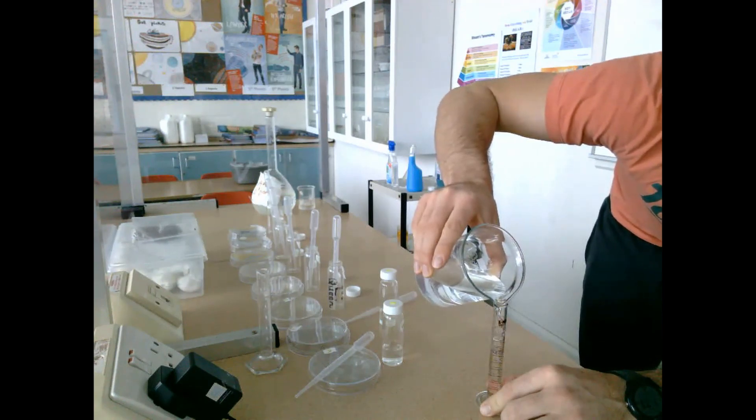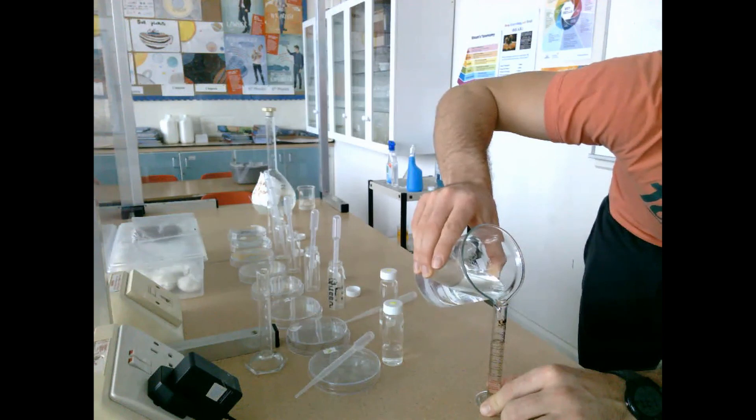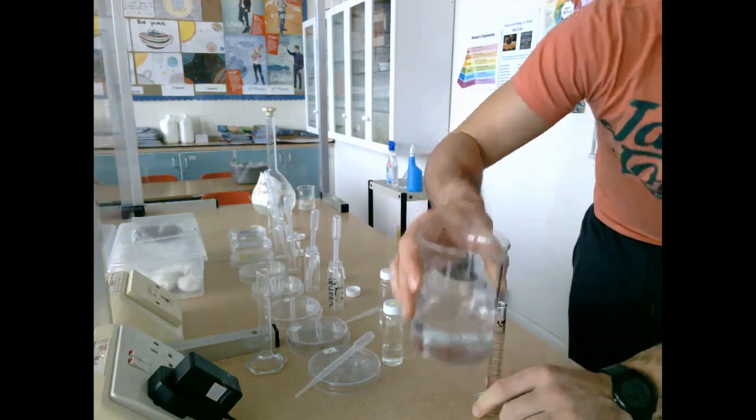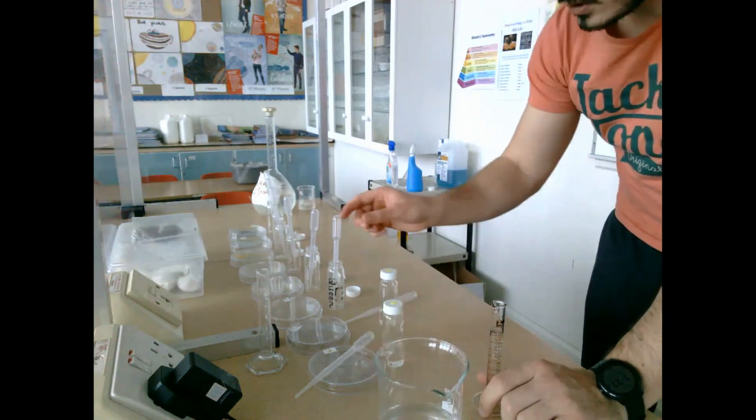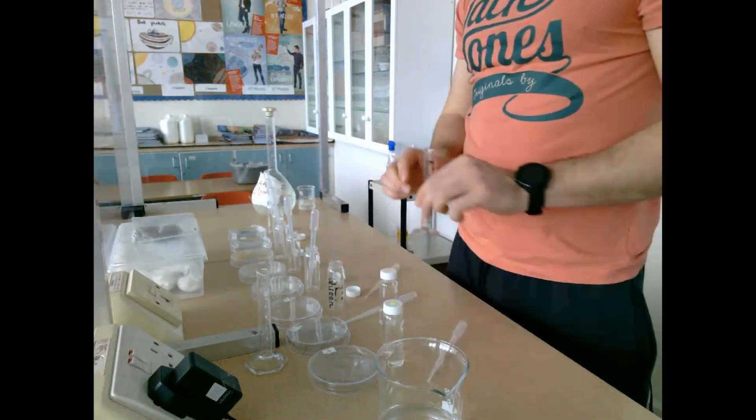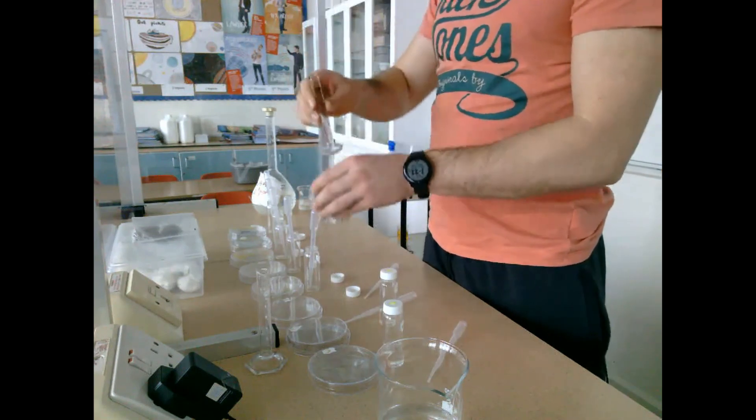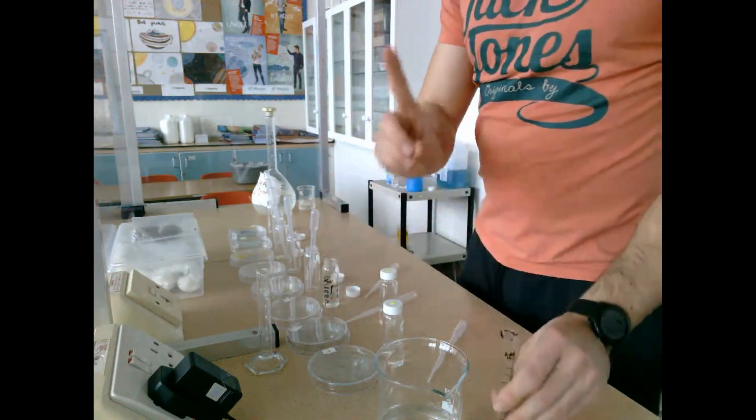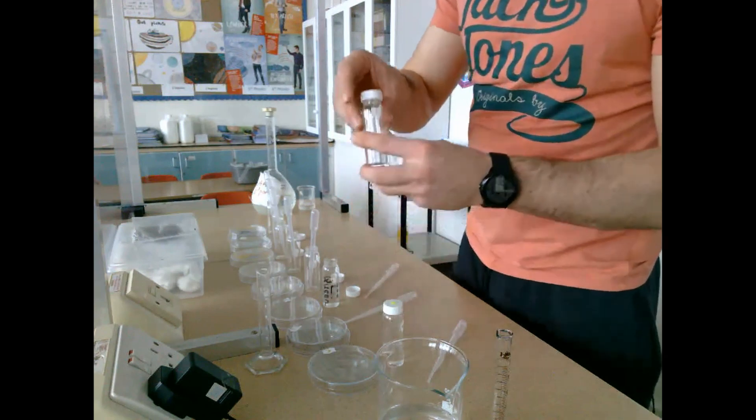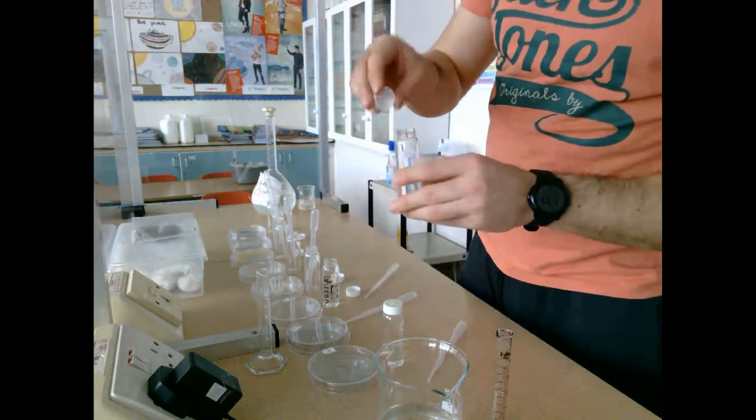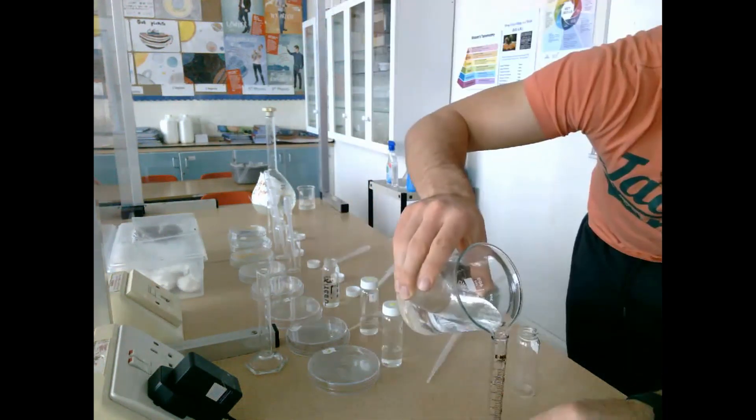To get the serial dilution started, we go back to glass jar number one and take one milliliter from that and add it to glass jar number two. This decreases the concentration to the power of ten. By the time we get to plate number eight, we wouldn't have been able to measure out concentrations that small using the mass balance scales.